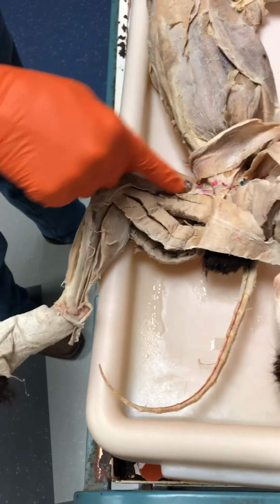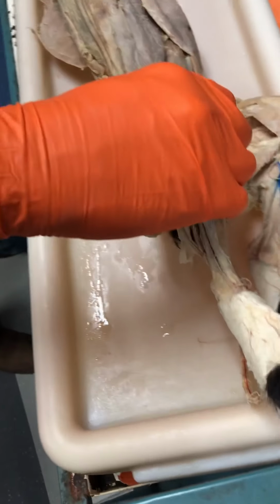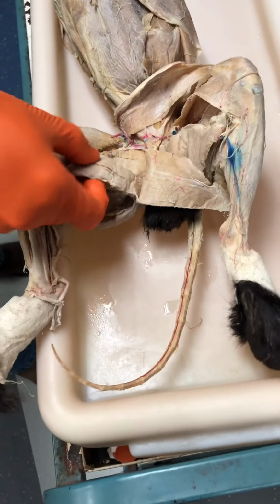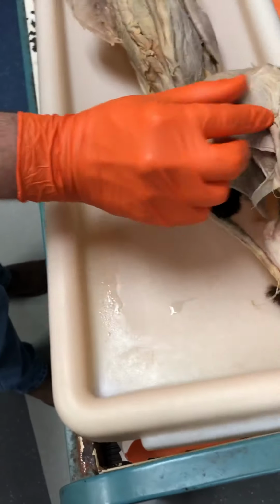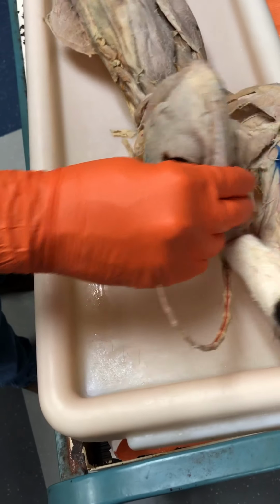And then you have the adductor group, which is just deep to the gracilis, and they both adduct the leg towards the midline. But if you pull the gracilis back, you can see the semimembranosus, you can see the semitendinosus because it comes to a sharp tendon. Those two, plus your biceps femoris, are the hamstrings. They cause the flexion of the knee.